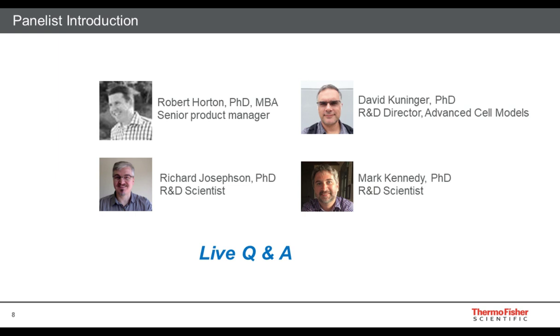The only other thing I would add on top of that is, make sure you do regular QC. Don't just assume you have all your samples when you get to the end. Typically, every day whenever I have a media change day, I either inspect every single well, or if you're lucky enough to have a microscope with an automated platform, you can take a single bright field snapshot of every well, look at it in one picture, and identify any samples that are lost, so you can monitor your samples accordingly. But really the only other way, as Richard mentioned, is percent media change.